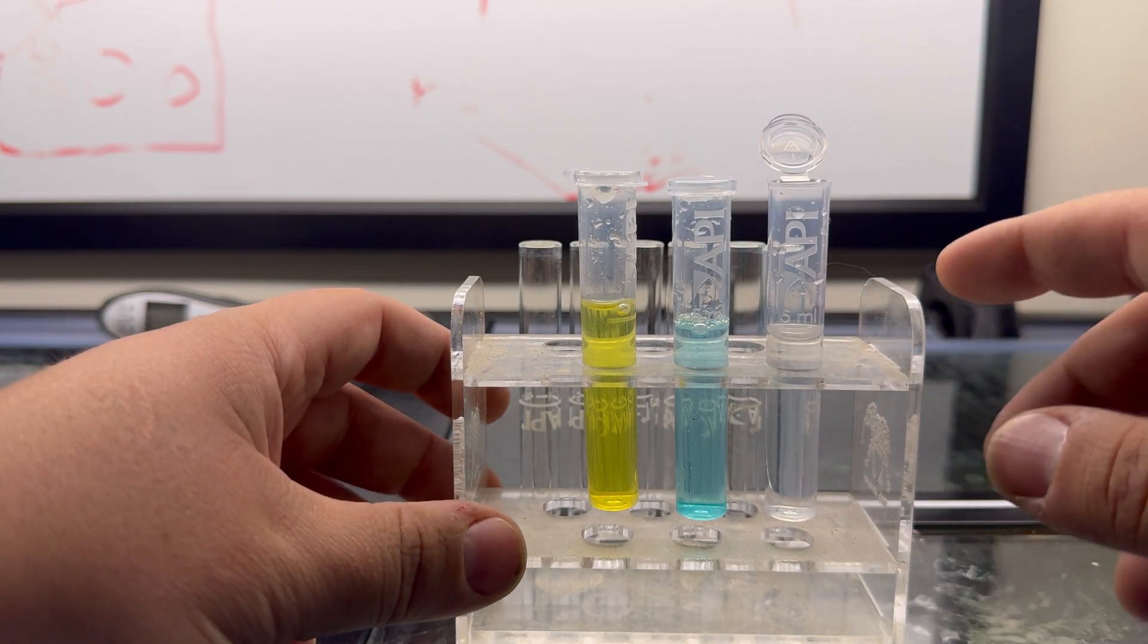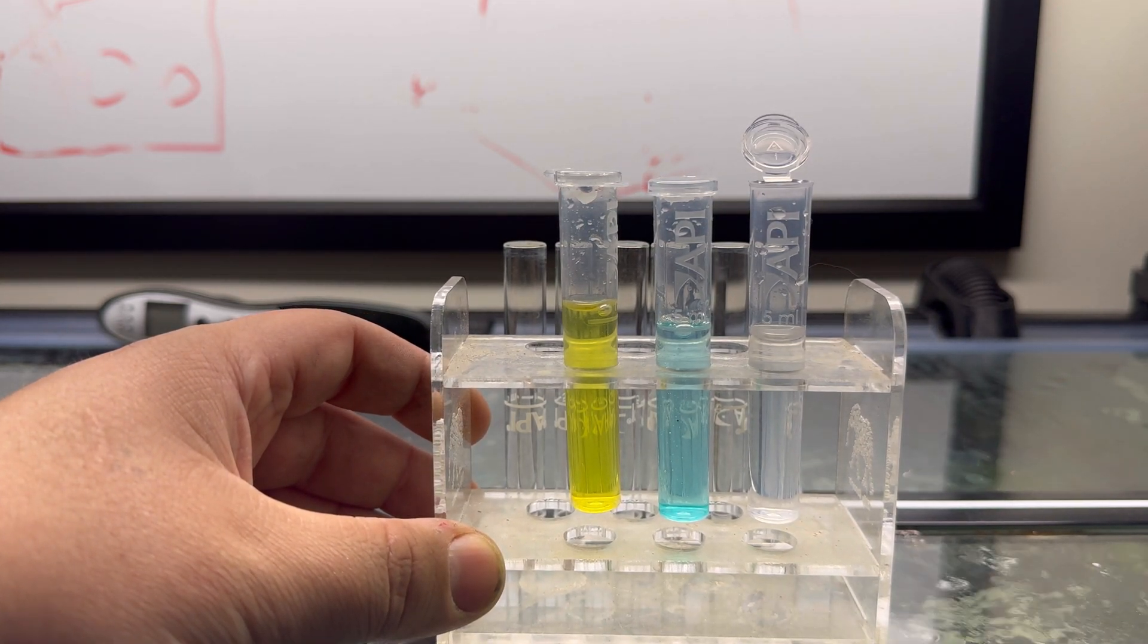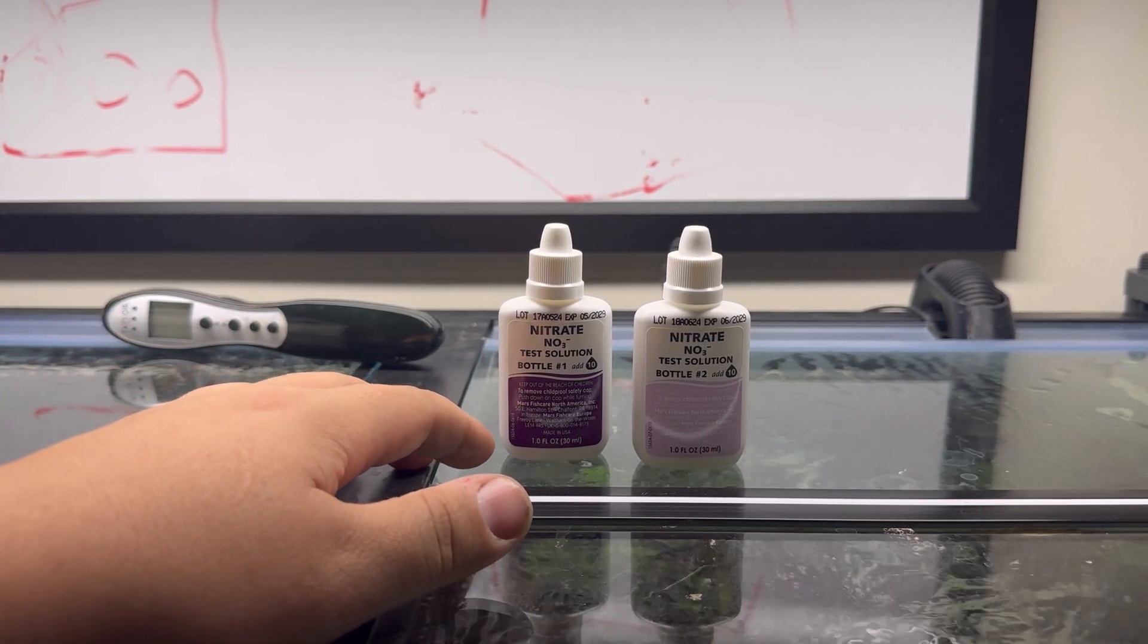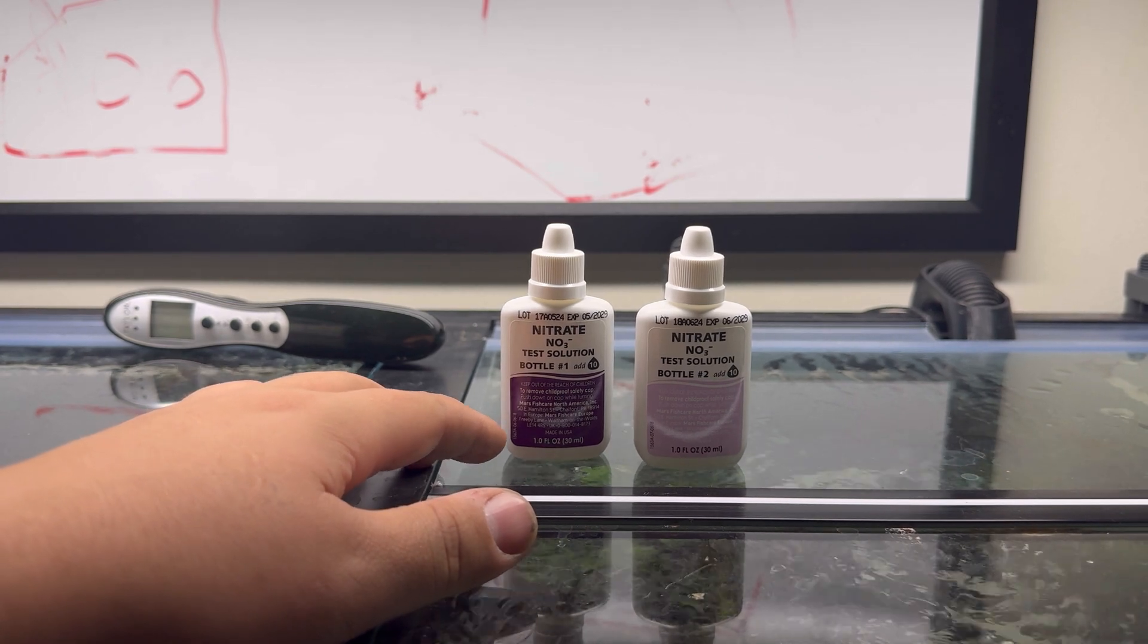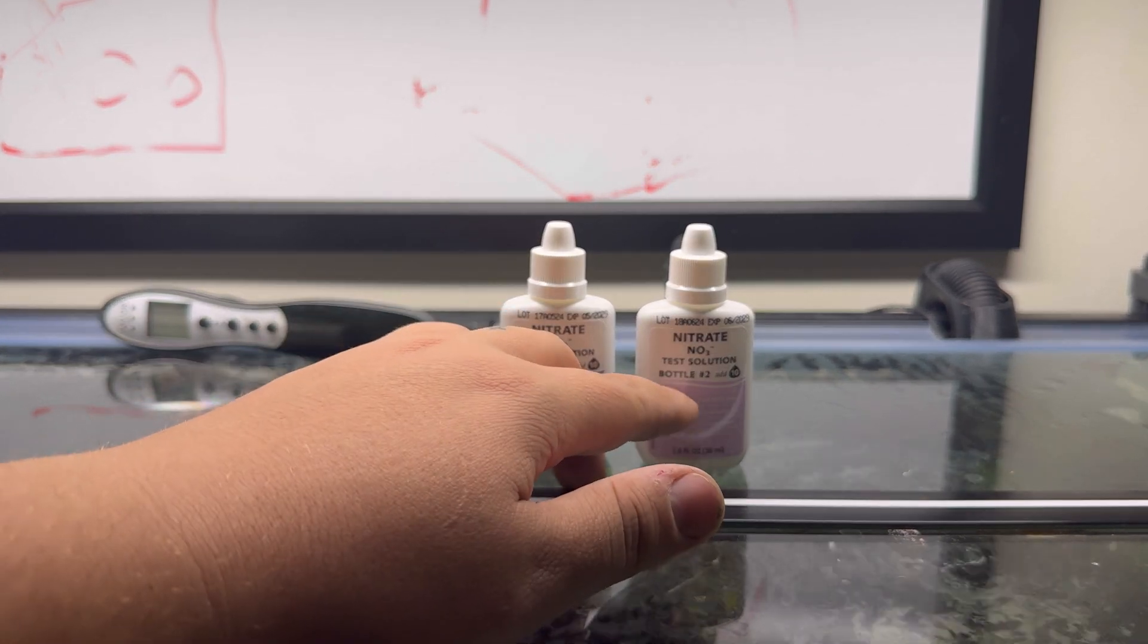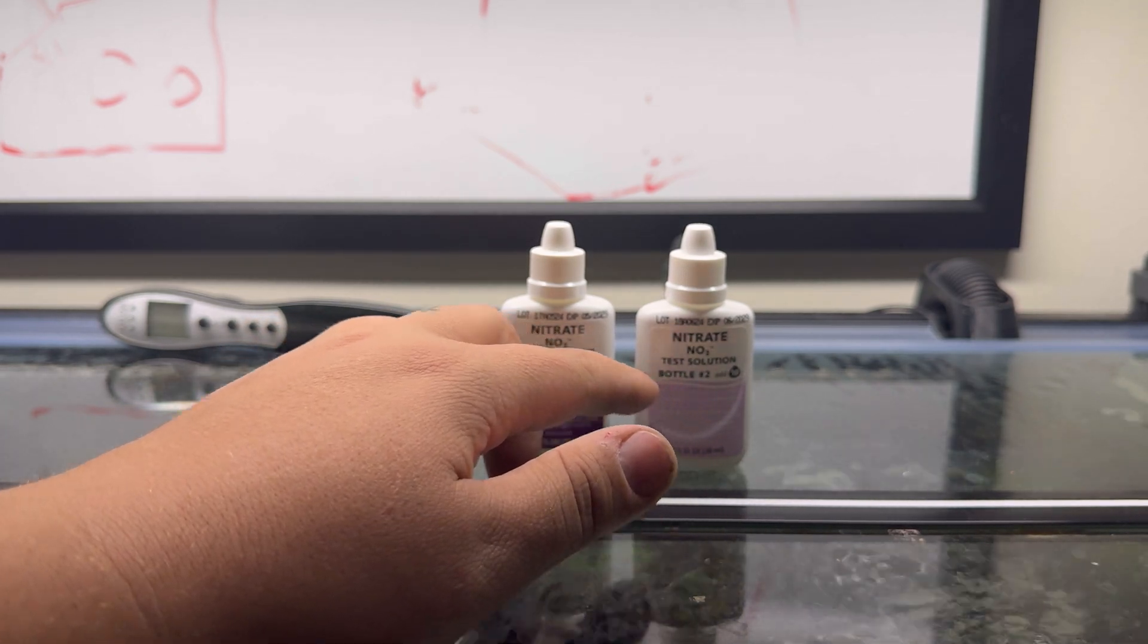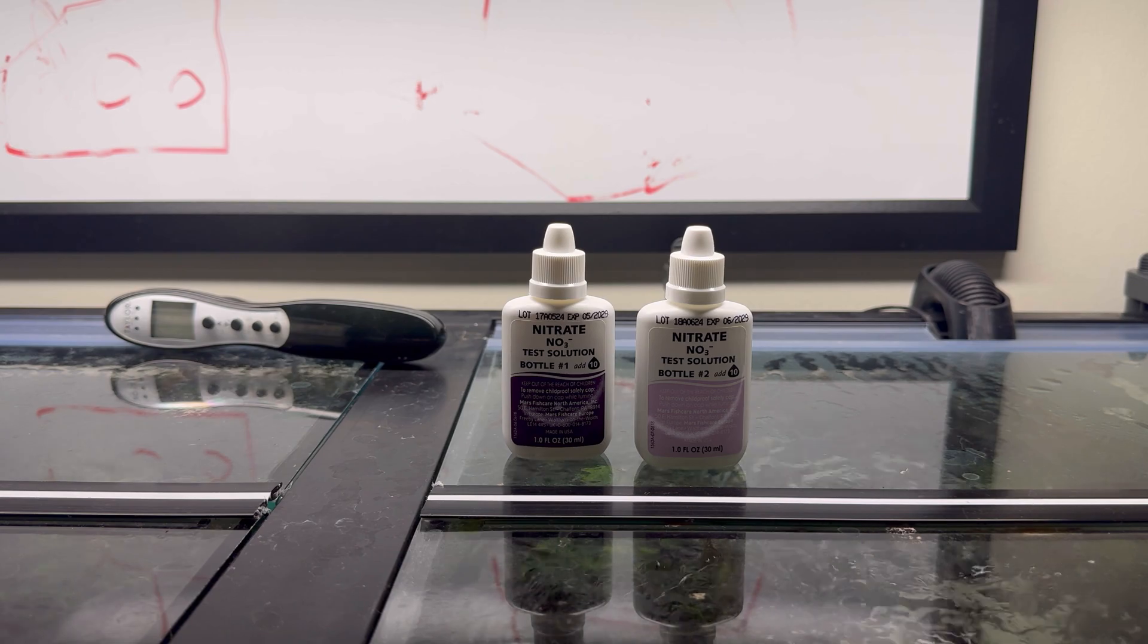Now we're going to jump into nitrate, which is a little bit more complex. I'm going to spend a couple more minutes breaking this one down for you. Again, just like the ammonia test, nitrate is a two-part test containing bottle number one and bottle number two, each of which you need to add 10 drops.